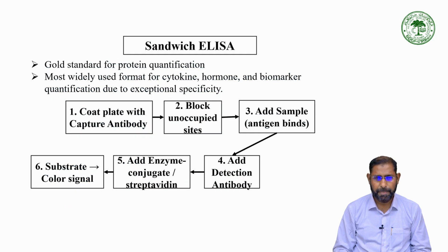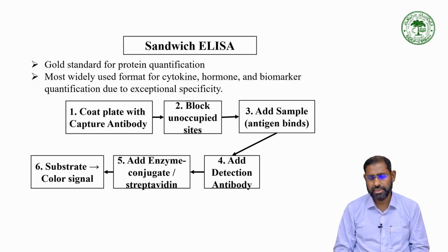Sandwich ELISA is the gold standard for protein quantification, meaning when we quantify, we need to do sandwich ELISA. It is the most widely used format for cytokines, hormones, and biomarker quantification due to its exceptional and very unique specificity.